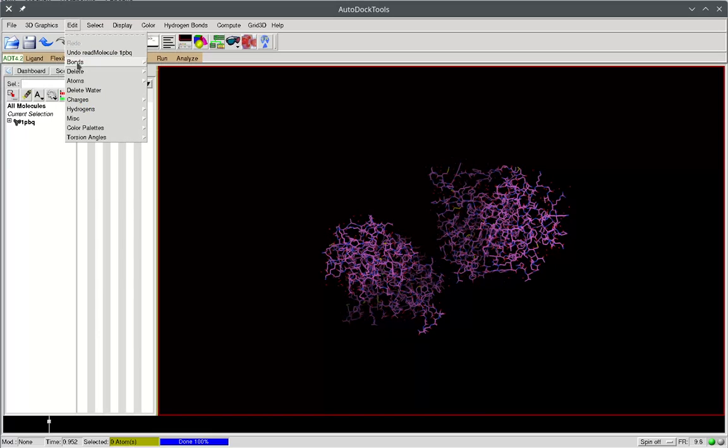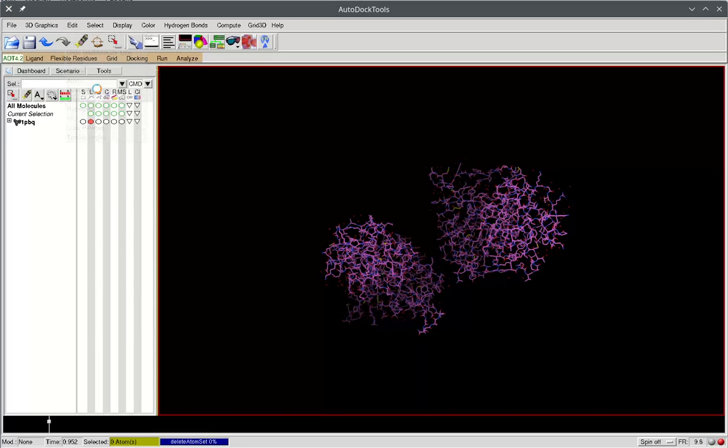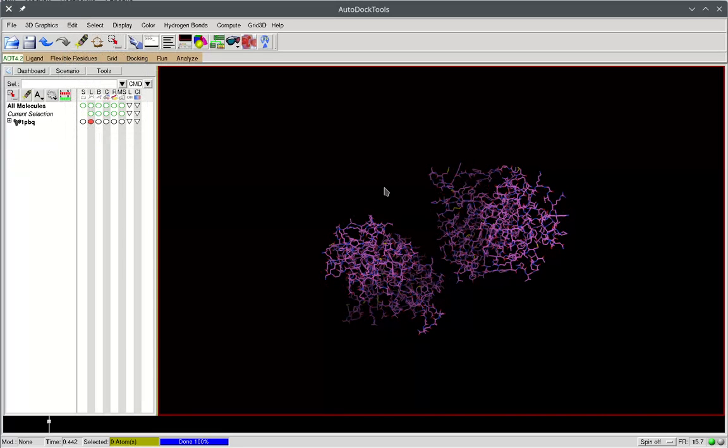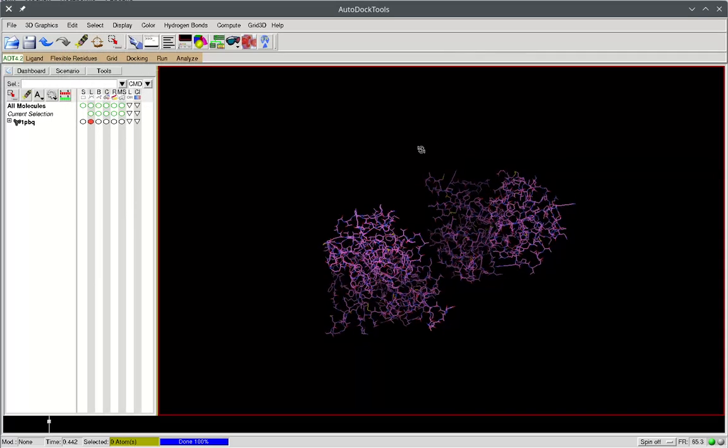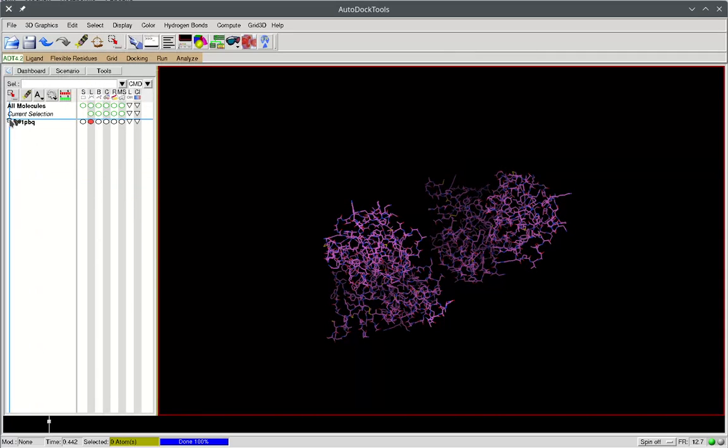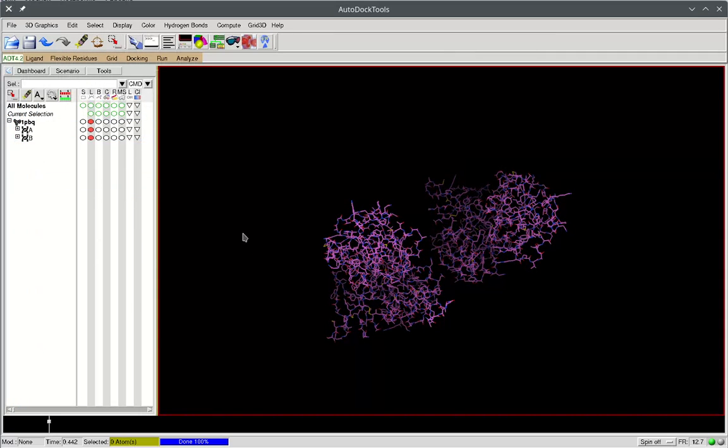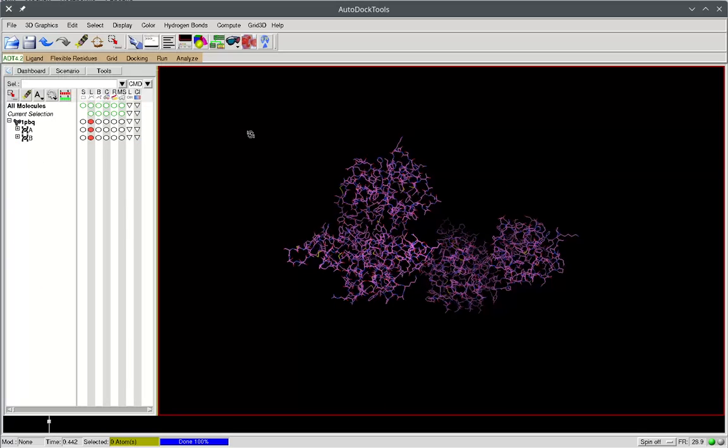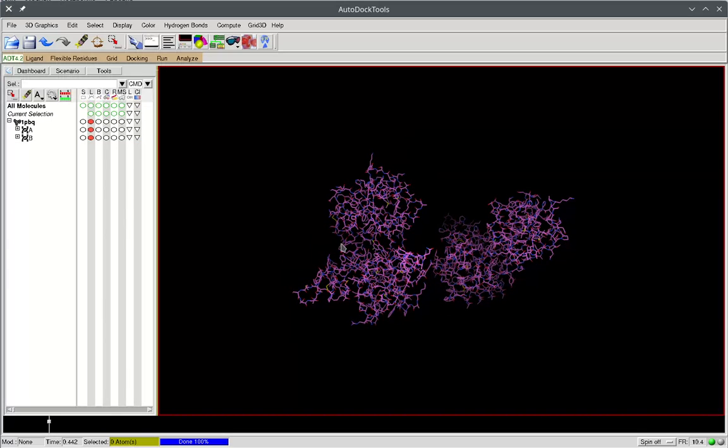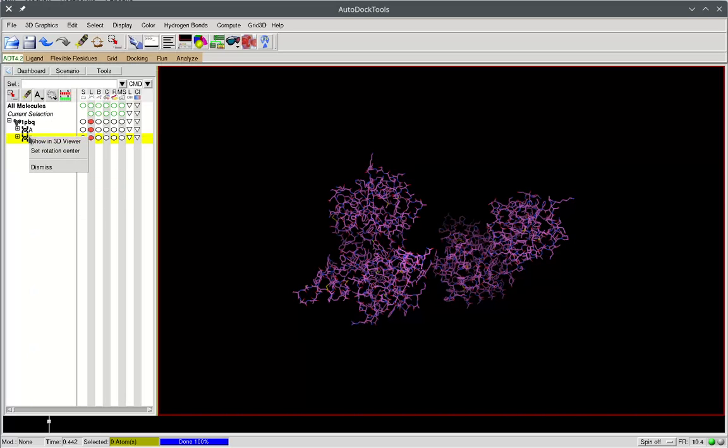First of all we need to delete all water molecules. Then we need to leave only one molecule that we want to dock. Usually it's quite often the situation when the crystallized structure contains two molecules in one file.